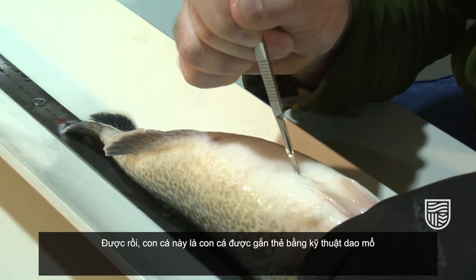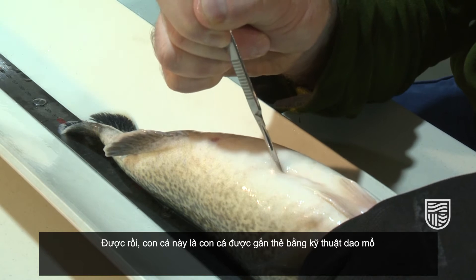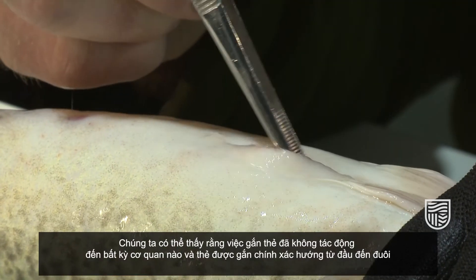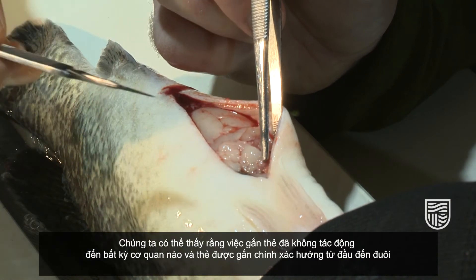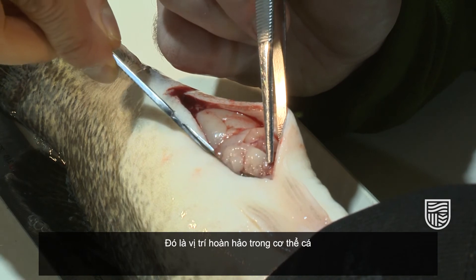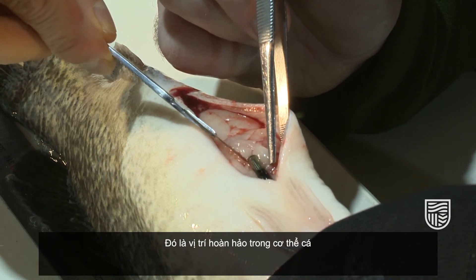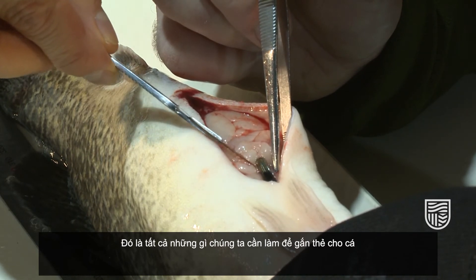This fish was tagged using the scalpel technique. We can see that the tag has missed any major organs and that the tag is correctly located pointing head to tail — that's the perfect position for the tag within the fish, and that's exactly what we want to see for a well-tagged fish.